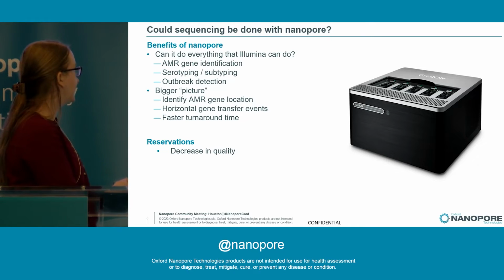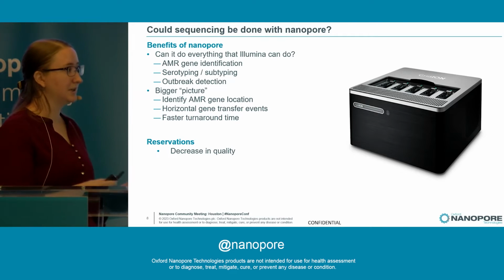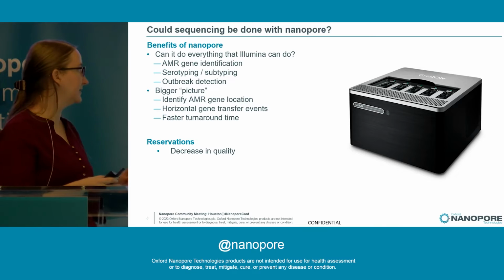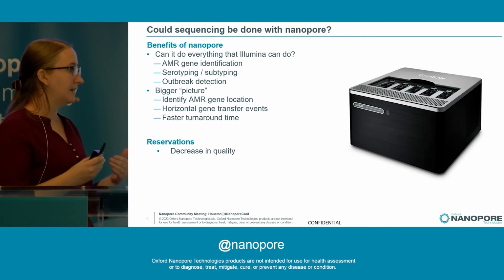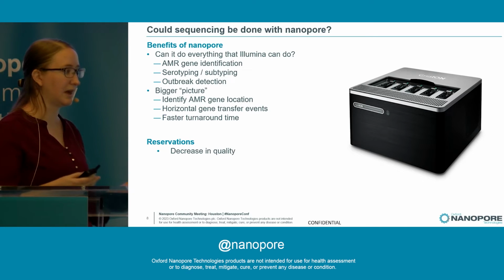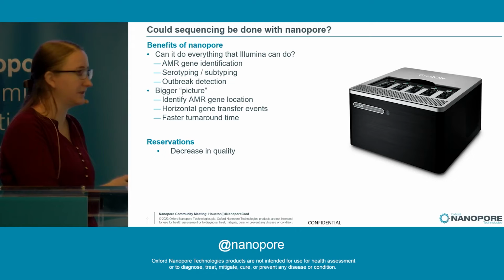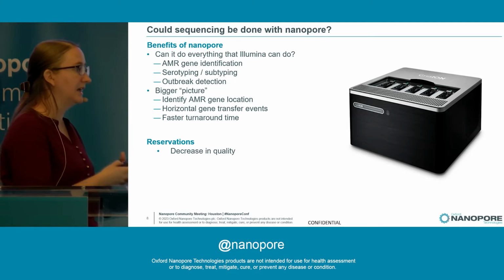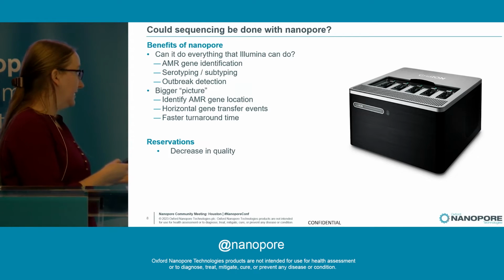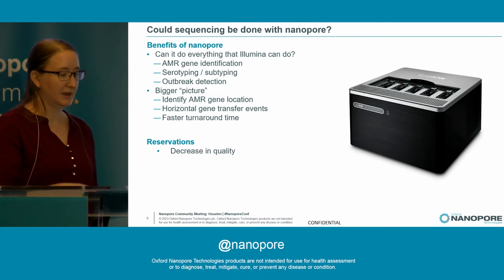But rumor has it, and I'm going to keep spreading this rumor, that if Illumina sequencing with its kind of incomplete genome assemblies is going to give us information, Nanopore has longer reads and can potentially complete the genome to a higher degree than Illumina sequencing. But first, we have to make sure that it's actually doing everything that Illumina is doing, so I've made this non-exhaustive list of benefits of Nanopore.